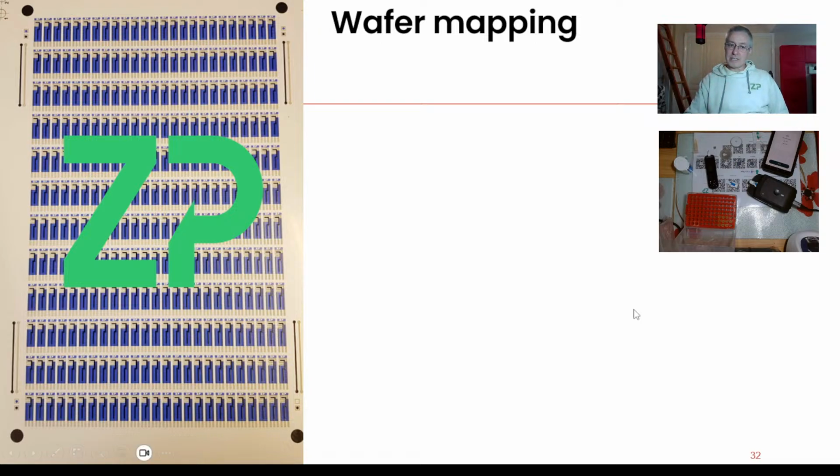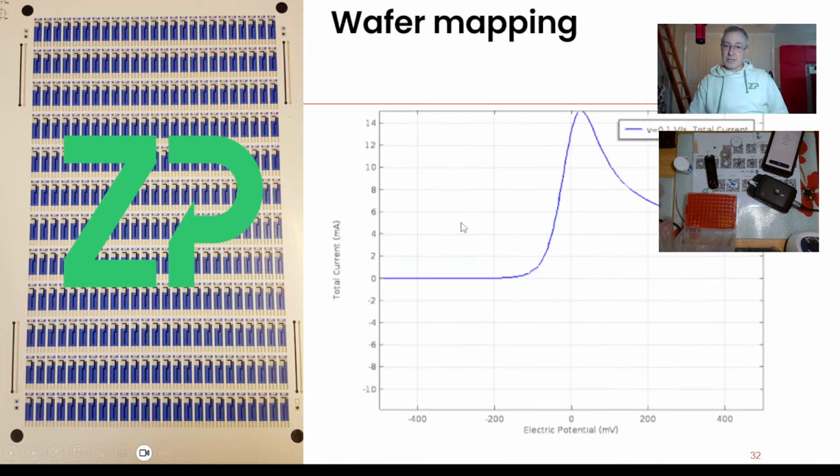But what we're interested in is actually, are all these electrodes similar? And are they similar enough that we can use them in a medical diagnostic? Now, our metric for similar is cyclic voltammetry. So we're only answering that question by cyclic voltammetry. So once people start bringing out different techniques, we have not tested these electrodes, for example, for similarity by OCP or by EIS. No, we have electrochemically ensured similarity or repeatability of manufacturing, but it's by discrete, fairly fast cyclic voltammetry experiments.